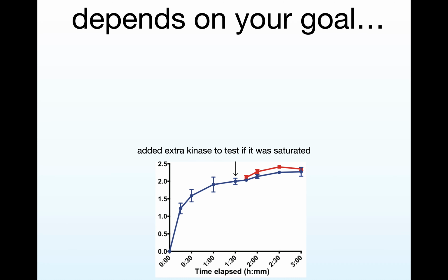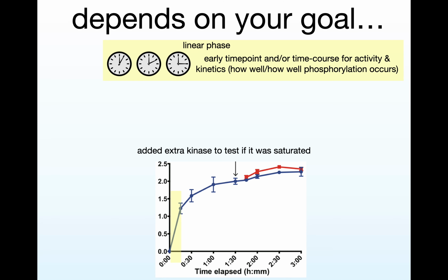Okay, so now the time. It depends on your goal. This was on the bottom. I'm just showing you a time course experiment where I was testing to see when I would reach the saturated phase. So I'm showing you time and then the moles of phosphorylation. It doesn't matter, you can just see that it goes up over time.